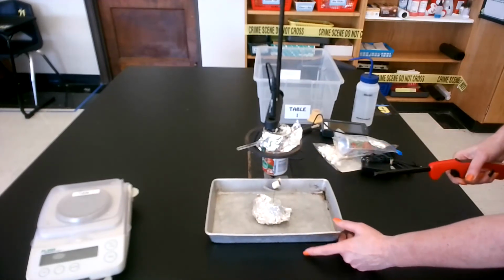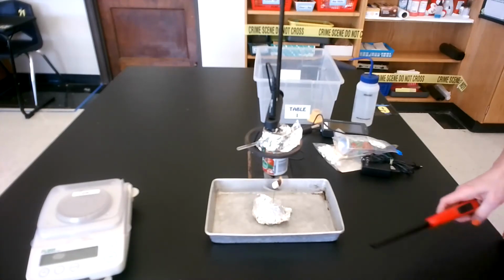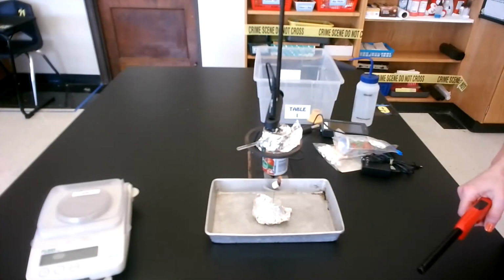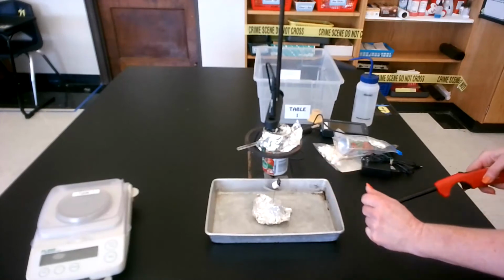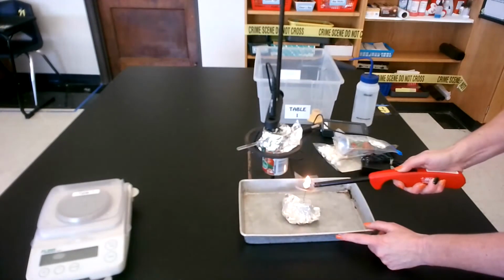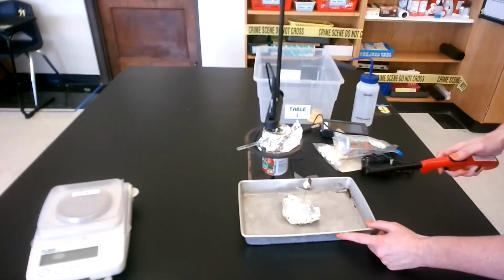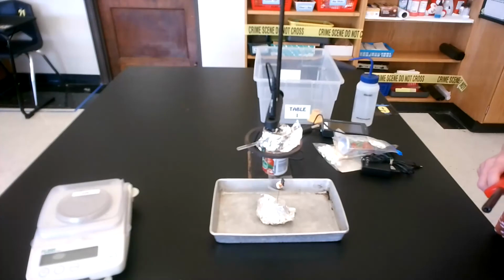Okay, here we go. So it's burning, looks like one of those little 4th of July snakes. Okay, so it'll keep burning. Then when it gets to smoke, I still got a little bit. So here's the smoke. I've got a little bit of red on the back. Okay, no more smoke is coming off, so I'm gonna relight. Still got some on the side. There we go. I'm gonna go back under.